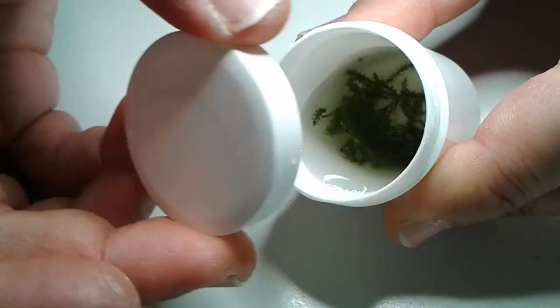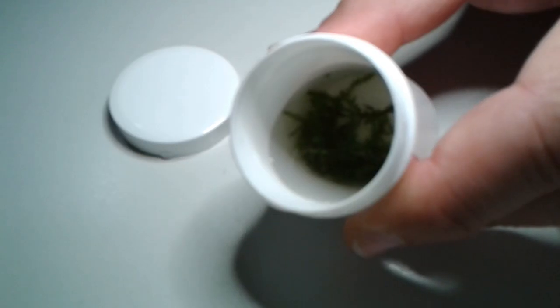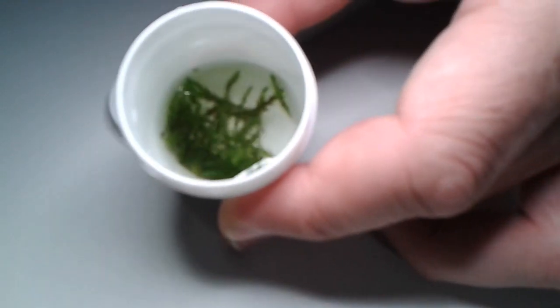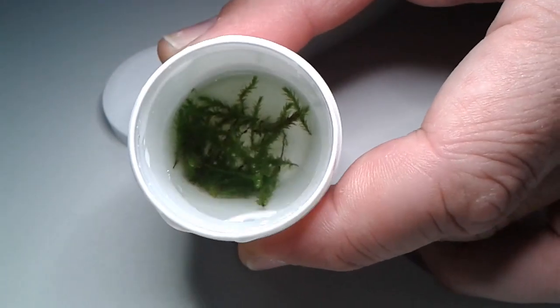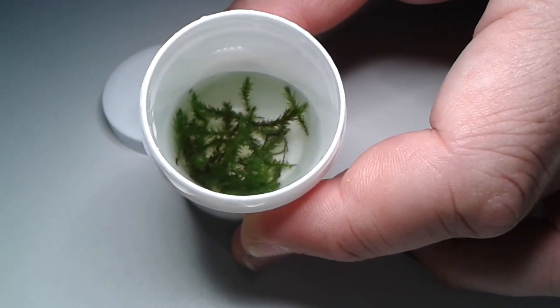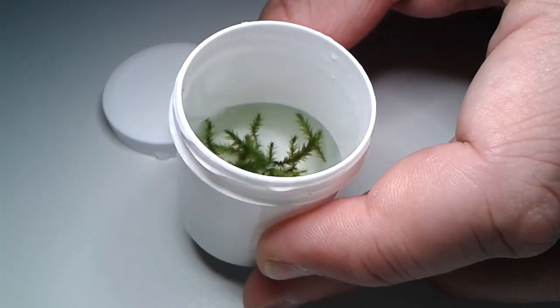Okay, let's have a look. Here is the sample. Let's adjust the lamp a little bit — it's a little bit out of focus, I think. Now I think that's better. Let's put a small piece of the moss on a microscope slide and then let's have a closer look.